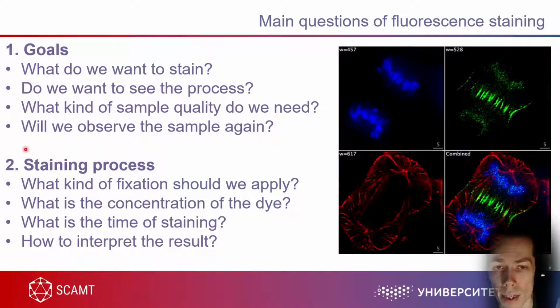And about the staining process, there are also a lot of questions, because what kind of fixation should we apply? If we need to observe the sample again, we should fix our cells with formaldehyde or something like this. And what kind of fixation should we use?